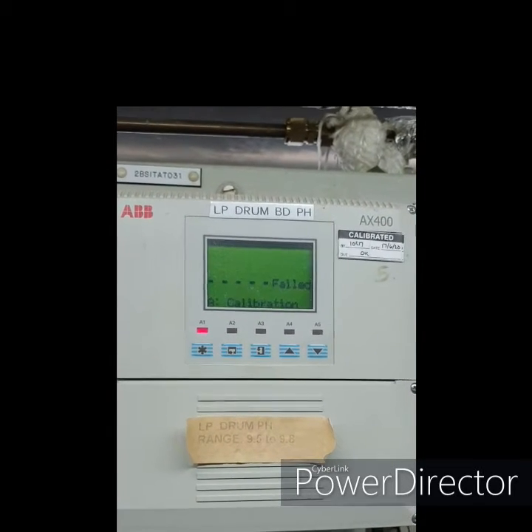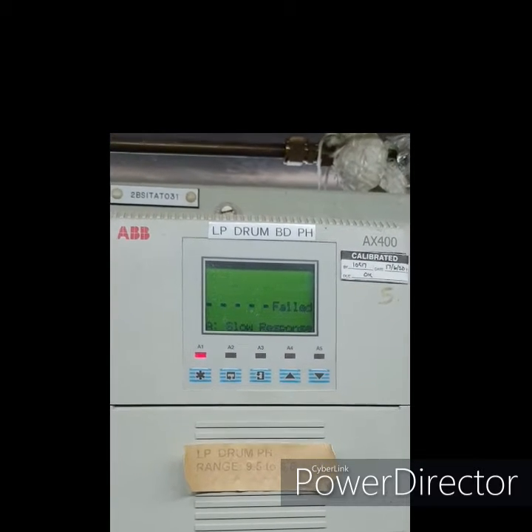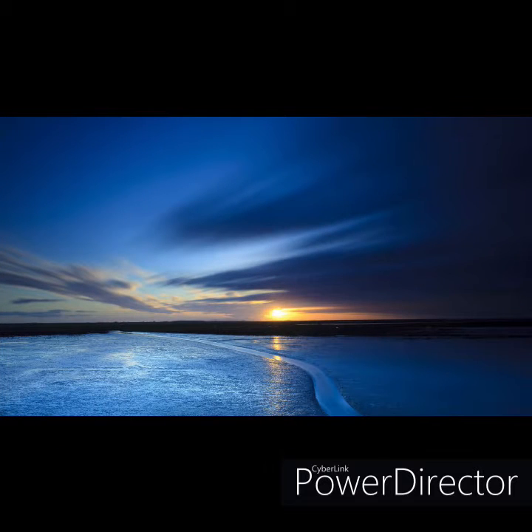Calibration fail. In the case of calibration fail, just immerse the sensor in the buffer for quite some time and repeat the process. Otherwise, replace the sensor.